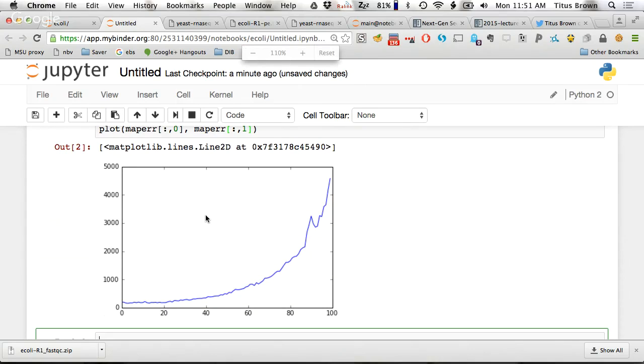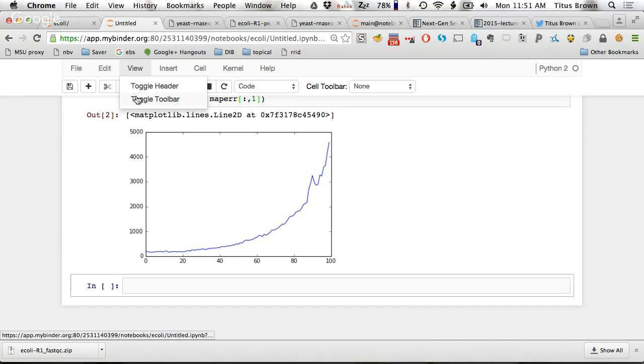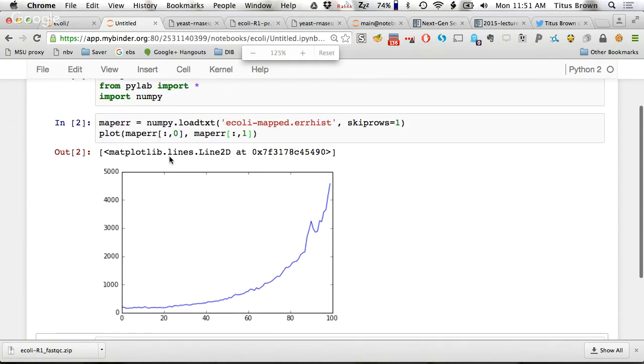And so this is what the mismatch profile looks like by the position in the read and number of mismatches at that position. And so you can see there's a lot higher incidence of mismatches at the 3' end of the read than at the 5' end of the read.